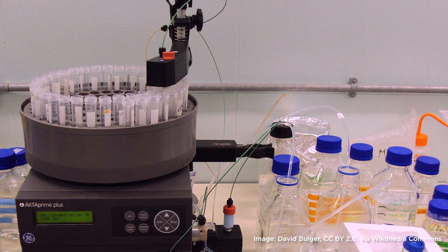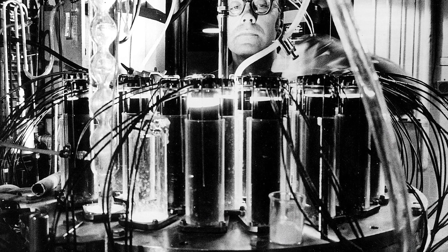While traditional protein expression and purification can be complicated and expensive, this lab makes the process classroom-friendly and is designed for students to truly understand the purification process.